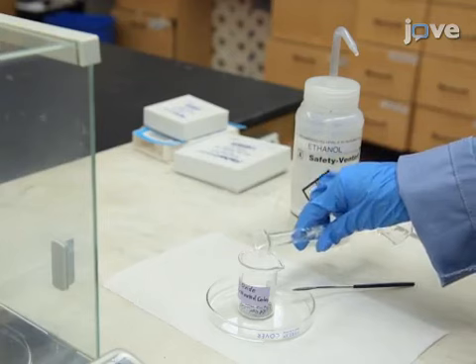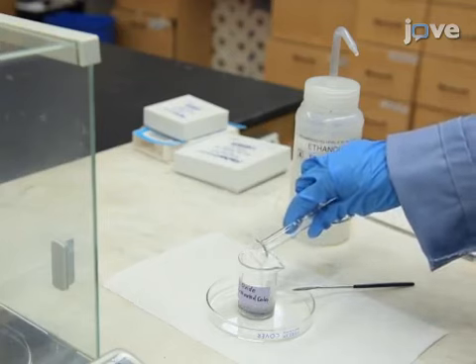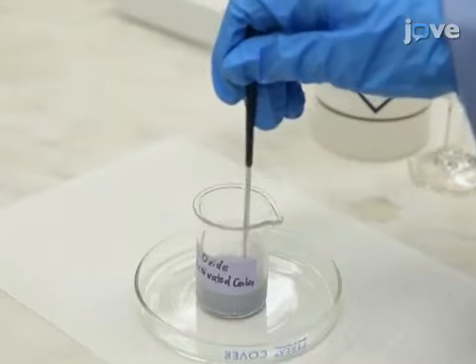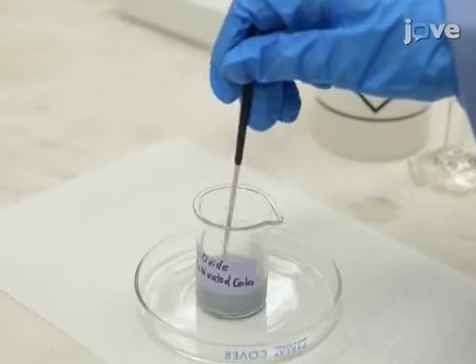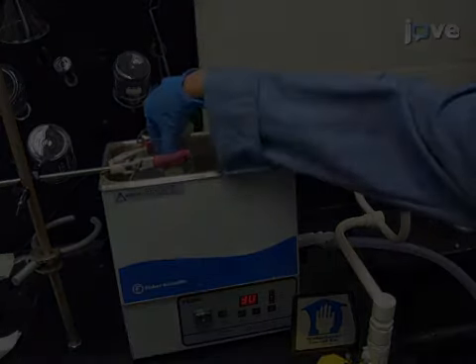Next, stir 1 gram of a 1:1 mixture by mass of zinc oxide nanopowder and activated carbon into 10 milliliters of 99.5% ethanol. Sonicate the mixture in a water bath at 20 degrees Celsius.